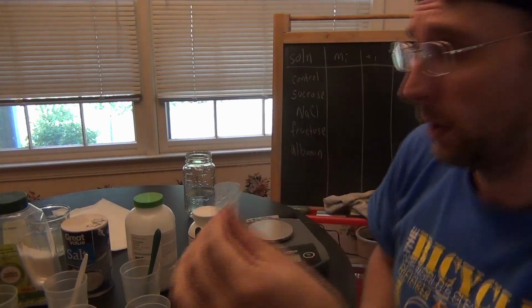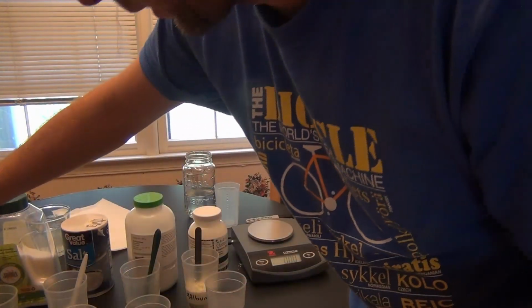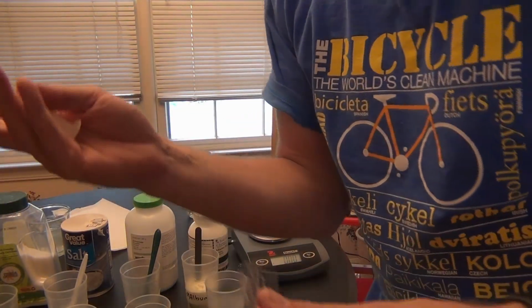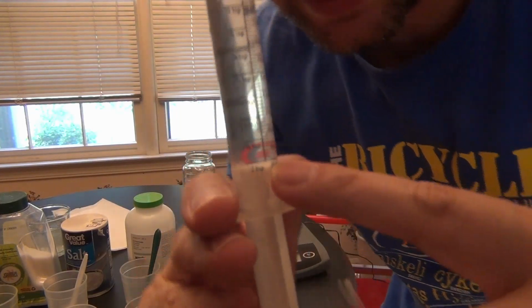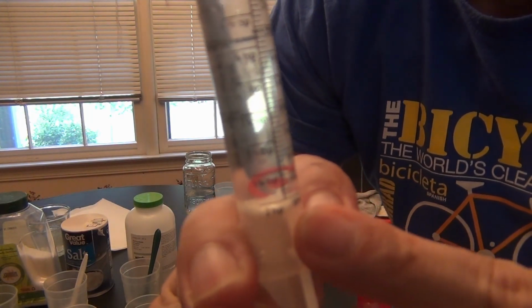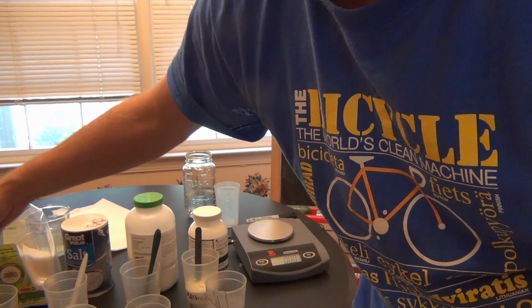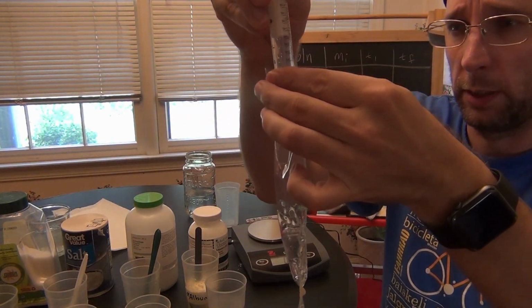with it open on one side, and I'm going to get a syringe, and I'm going to add 10 milliliters of each solution. By the way, the 10 mil mark is down here, and use the plunger right at that 10 mil mark. I got a little bit of air bubble, so I purposely over pulled some so I can push that air bubble out. A little bit more. Okay, so I'm going to put that 10 milliliters inside the dialysis tubing.